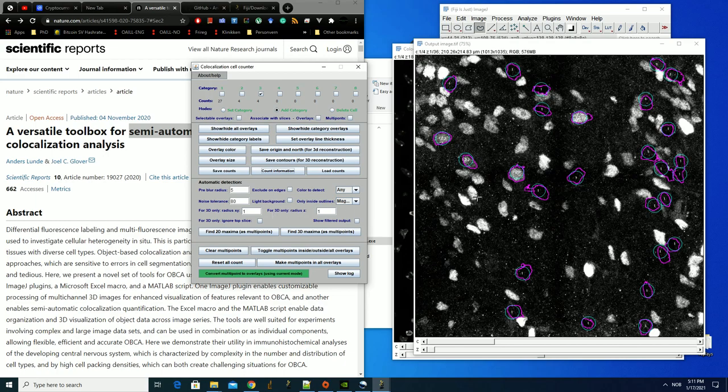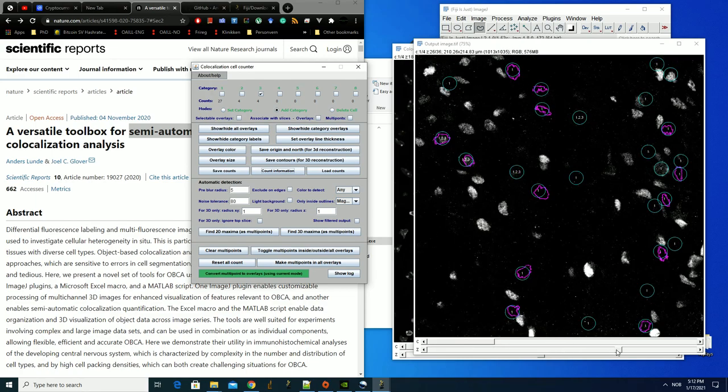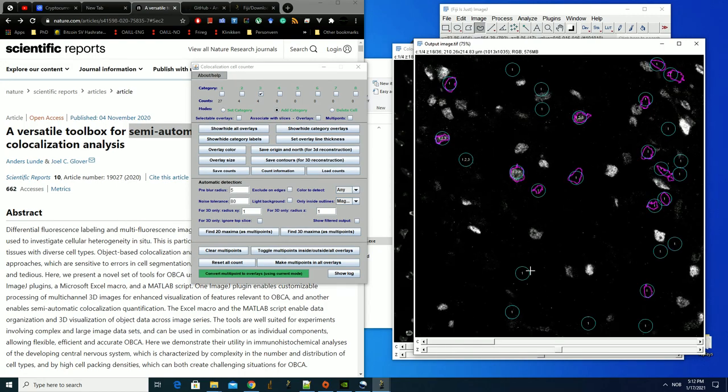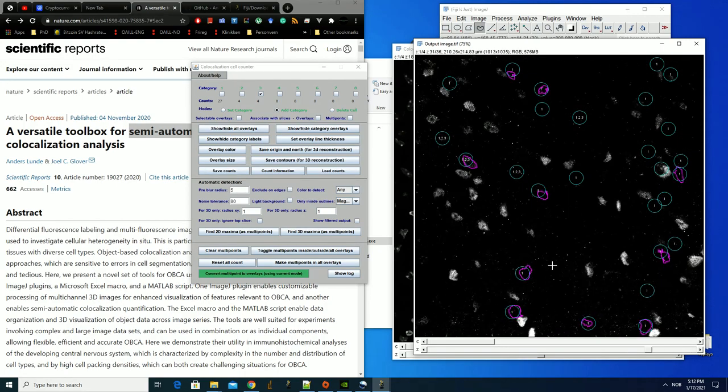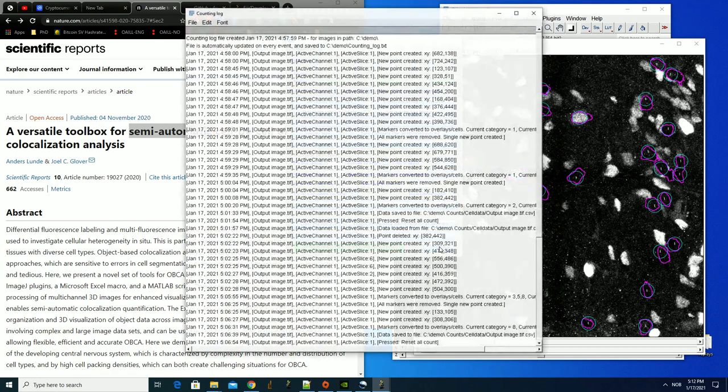And lastly I want to say something about that this is a somewhat subjective way of analyzing, because it relies on some objective automatic detection, but there is also some room for subjective interference here, which is partly why we have this logging feature.